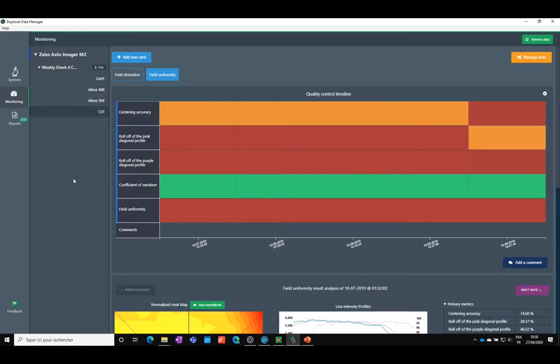This particular feature has really been designed to work if you do periodic measurements, like every week, every month, maybe every day, if you really have one system you want to track daily. But yeah, this is the idea. You acquire the images automatically, you process them automatically, and all the results are in your database, and you can move on and do your actual work of core imaging facility manager.